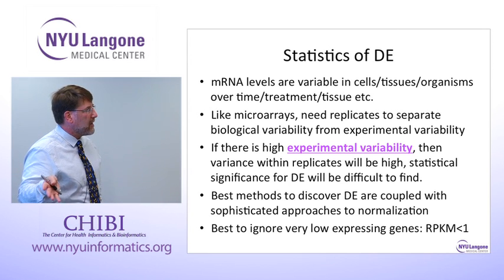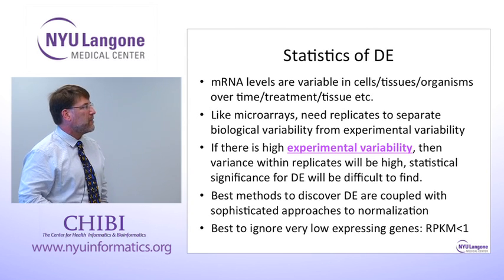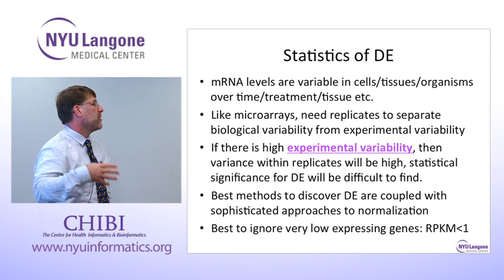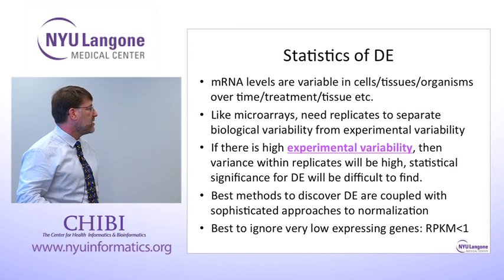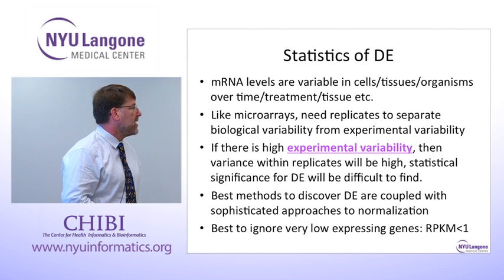RNA-seq is increasing in popularity because it's becoming cheaper, and you can reuse the data for other purposes. I don't think it's better than microarray, although it certainly has a better dynamic range. So you can see genes that are expressed at a lower level here. You get better accuracy for genes that are expressed at a really high level. And the prices are coming down. I mean, you can do one experiment and compare.